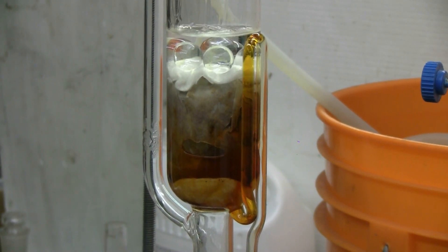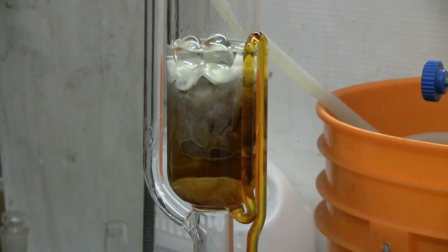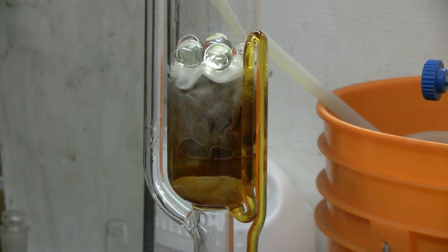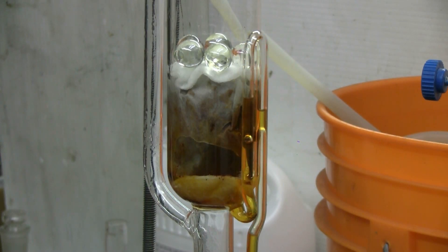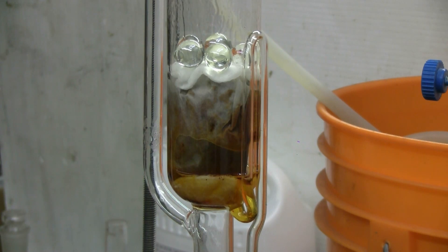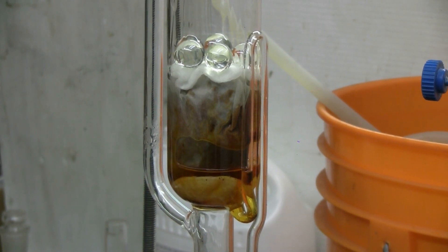This is cycle 10 of the Soxhlet extraction of powdered sweet paprika by ethanol. The extract is still a good yellow-orange color at cycle 10, but the paprika itself in the filter paper is slowly starting to fade in color. I'll pick up the video again at cycle number 20.